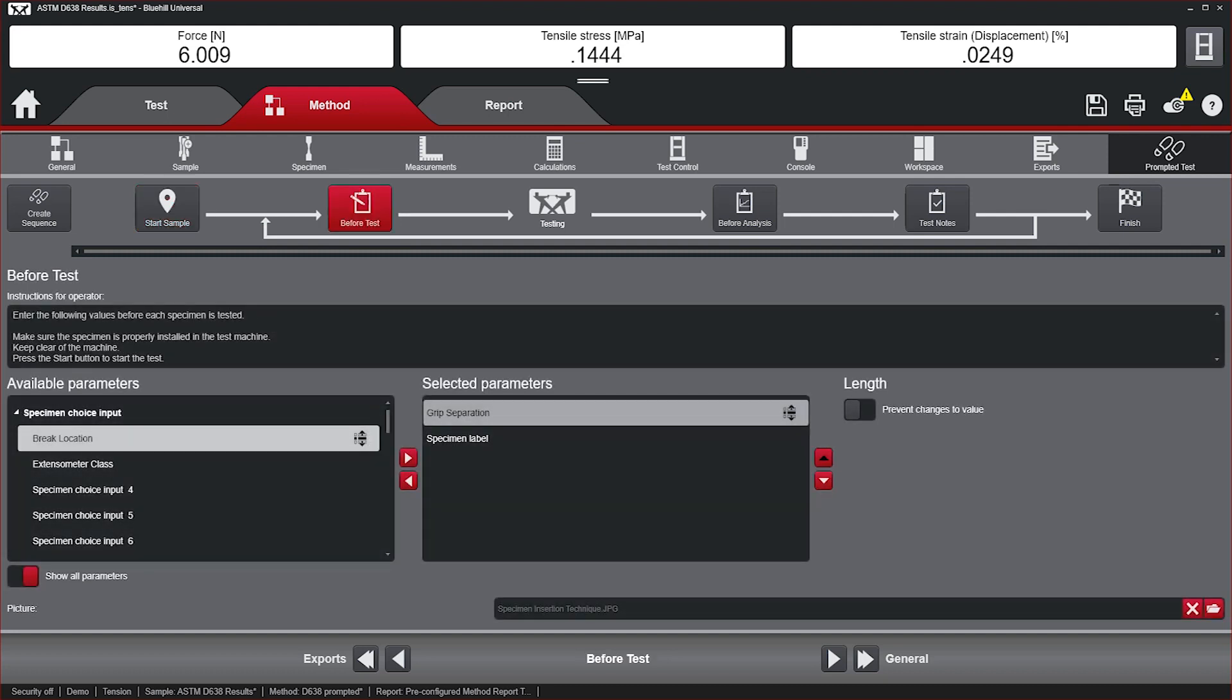Before Test – is where users would enter information like specimen dimensions, specimen ID, and instructions for properly placing the specimen in the load string.